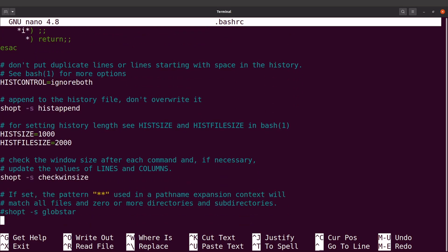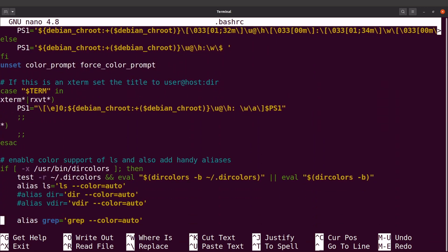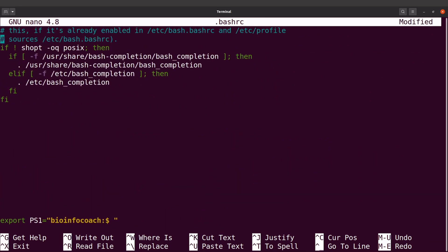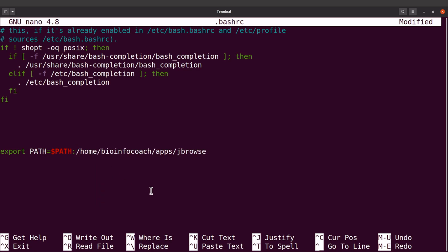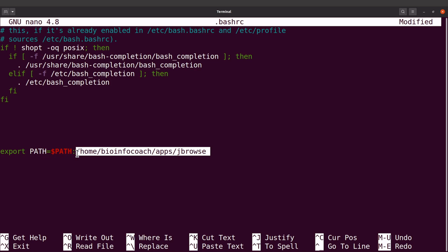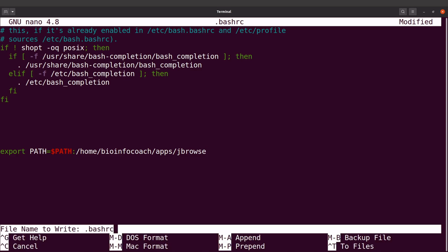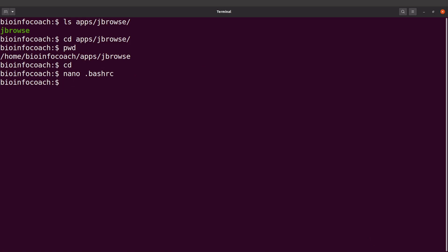I'll add the export line here: export PATH=$PATH: and then paste the path I copied. Make sure you have the correct path, with a colon separating $PATH from your new path entry. Once that's done, exit and save the changes.